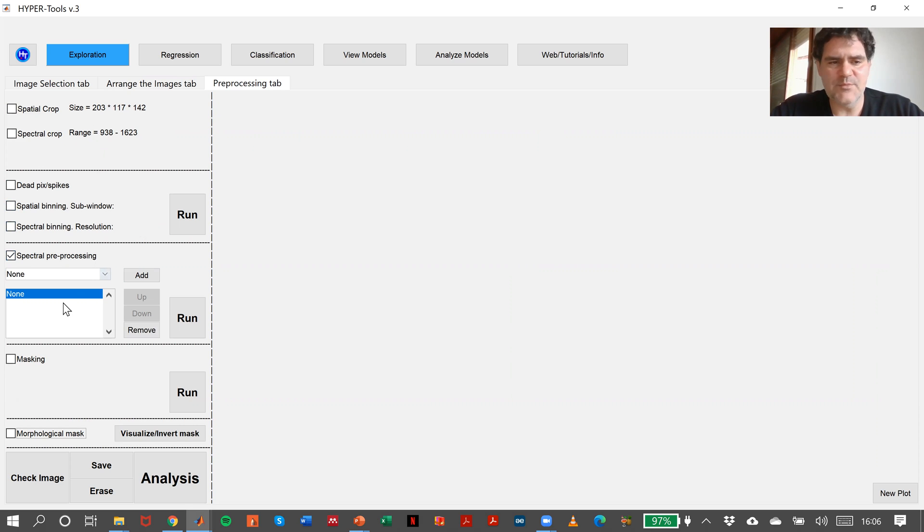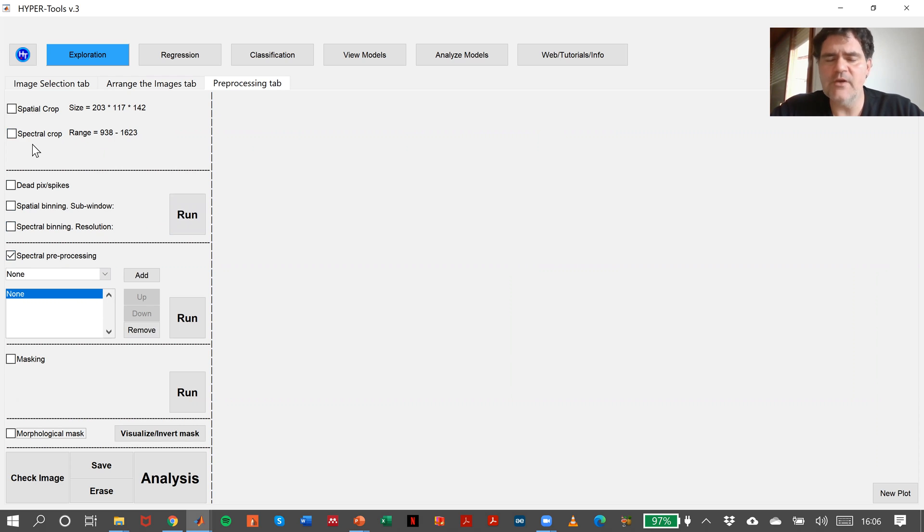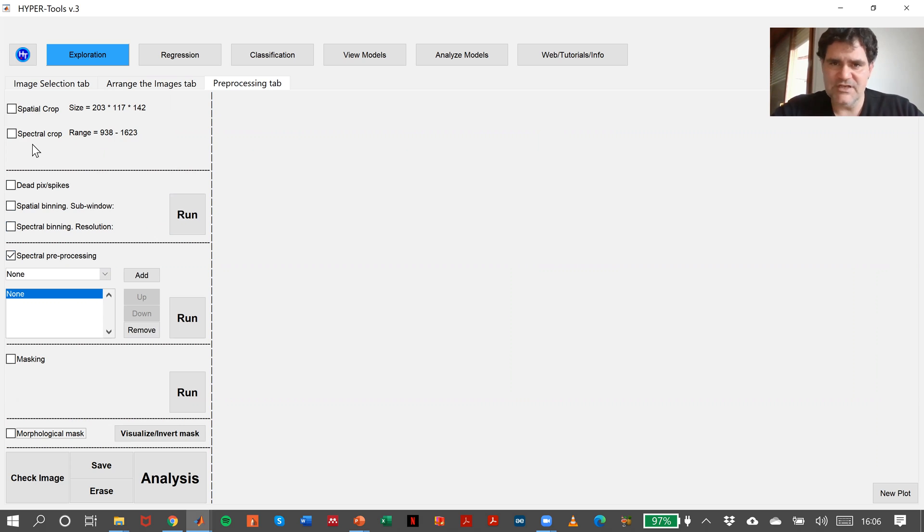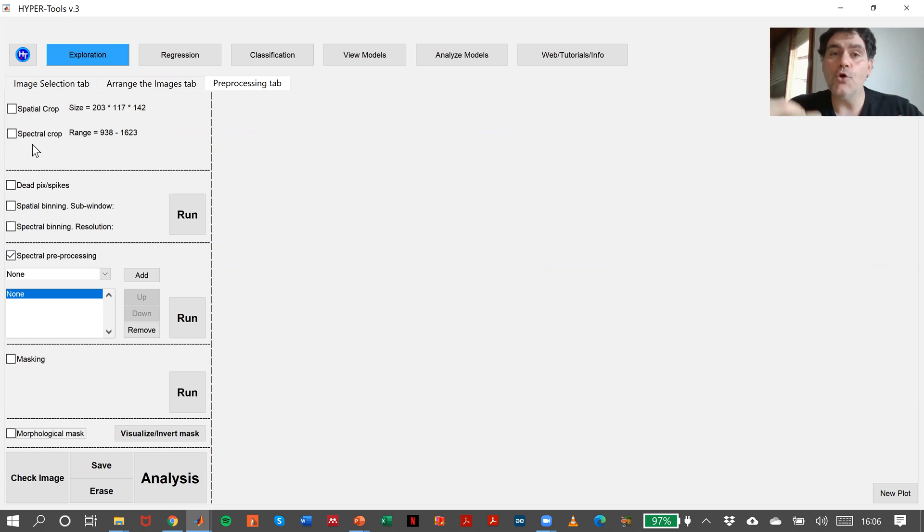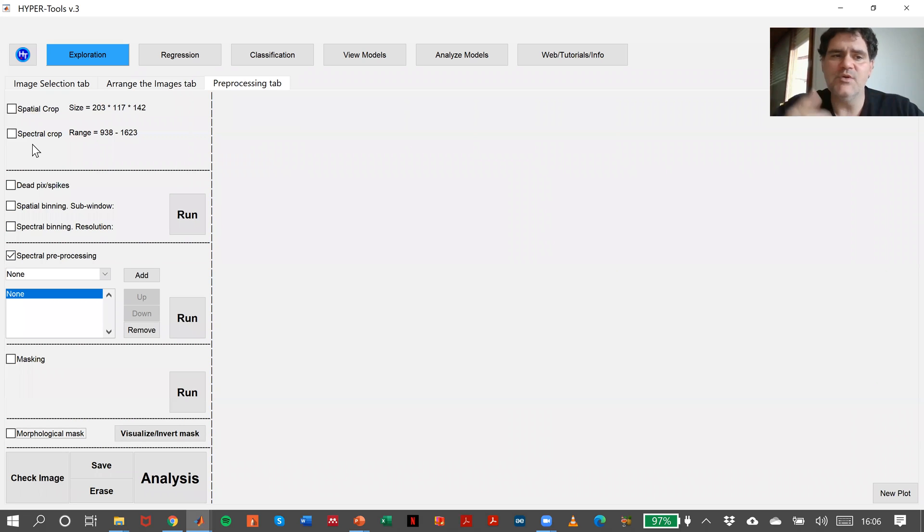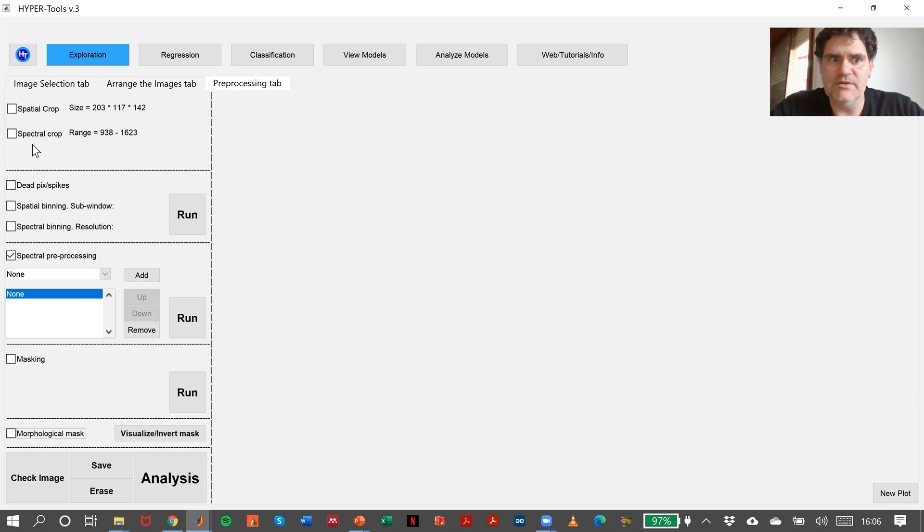If you want to make a spectral preprocessing and then a spatial crop or spectral crop, you can do it. The actual preprocessing will be performed on the previous preprocessing or on the original image if you haven't done any preprocessing in that moment.